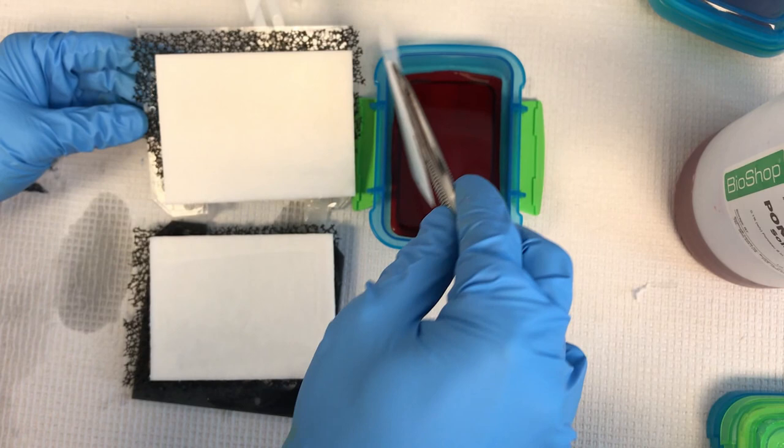Soak the membrane in Ponceau Red solution for 7 minutes at room temperature on a shaker.